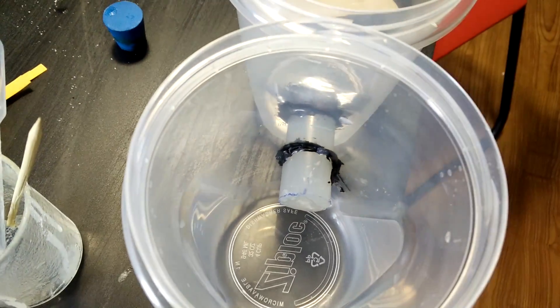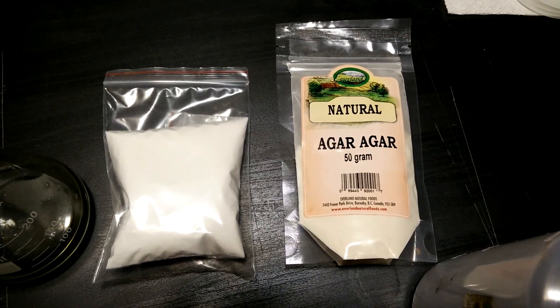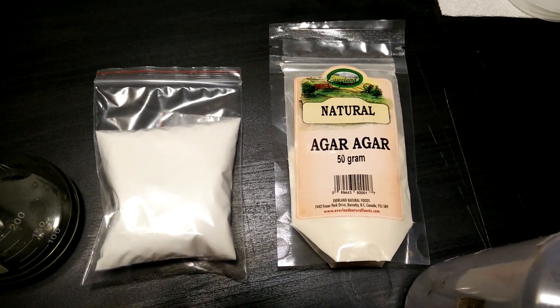Finally you'll need the membrane itself. Again you have lots of options. I tried agar, vegetable gelatin, and carboxymethyl cellulose and they all worked well, so use whatever you can find. You can get them online or at health food or specialty stores.